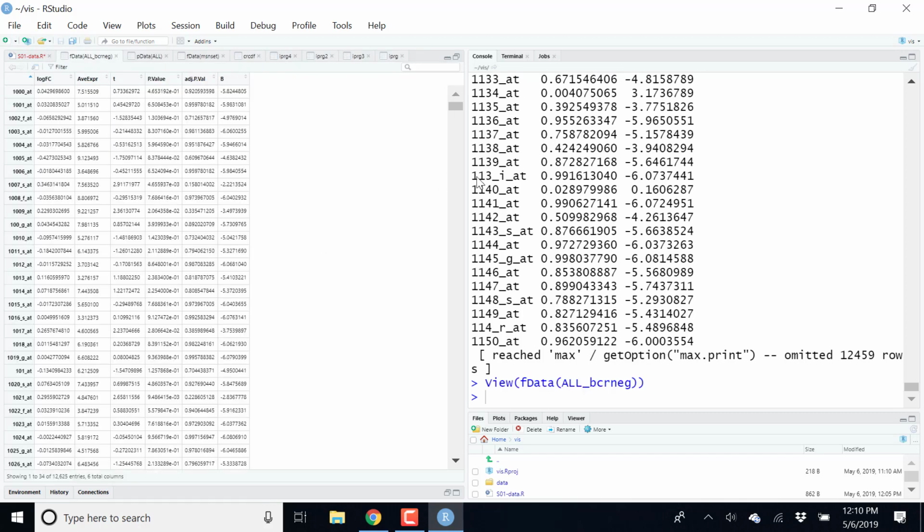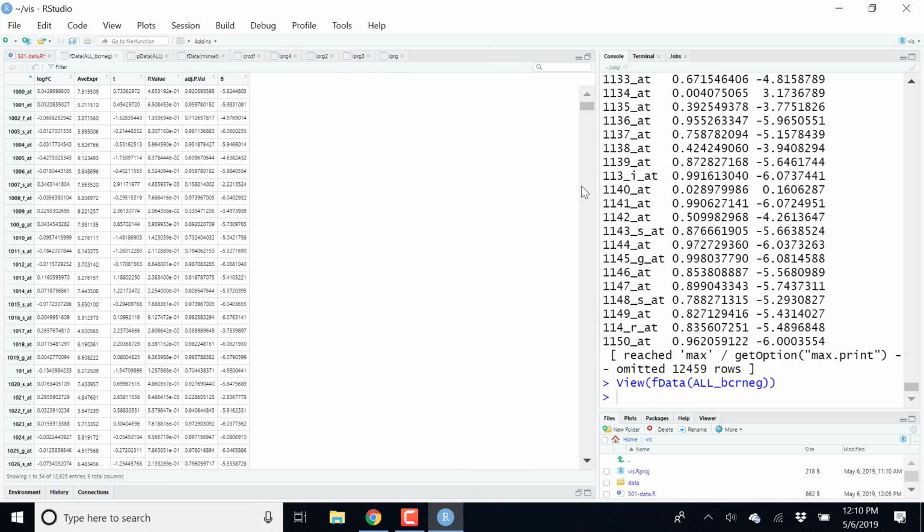What we are going to focus on is the fact that the results of these analyses, for each of these genes here, are stored as part of the object here in the feature metadata, which is something that is extremely important for some visualizations like this that we're going to generate probably tomorrow.